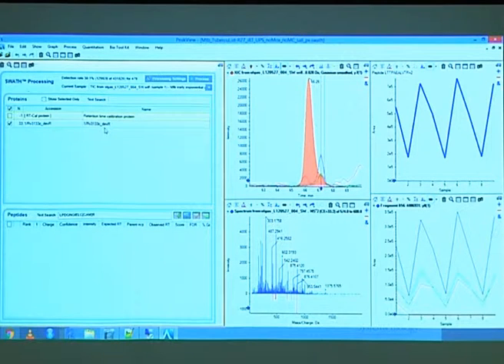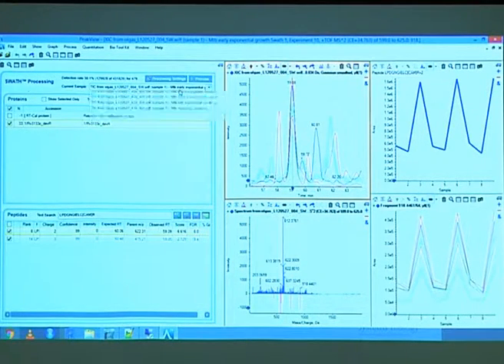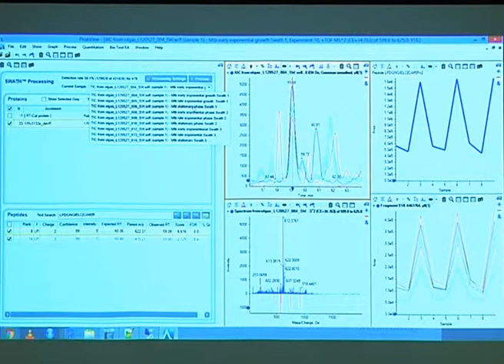One thing you can do for looking at interferences is you can look at the dynamic change, if it has a dynamic change. This one here is a peptide from the DOS-R regulator. And now you see in the first two files it's low and then it's high, and low again and high. So if you look at these ones, it has some shoulder peaks or peaks that are close by that might give rise to an interference.